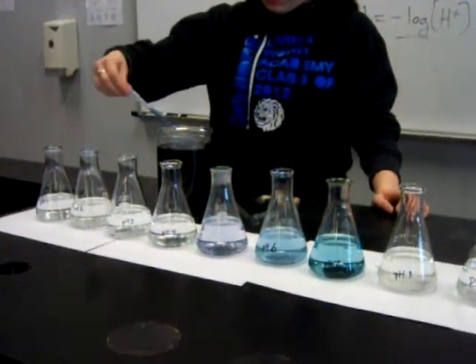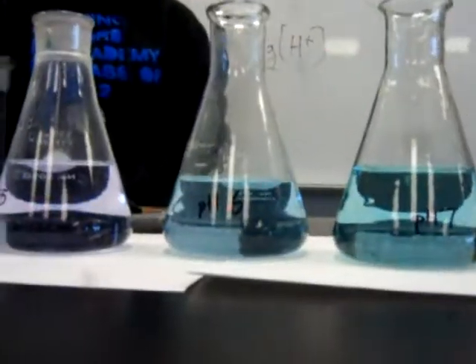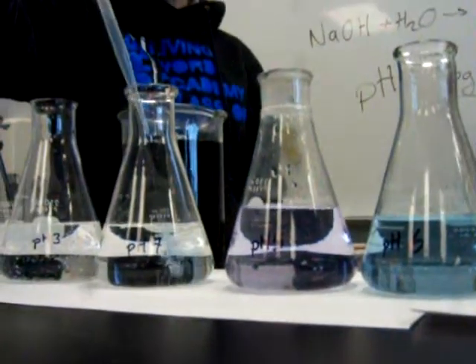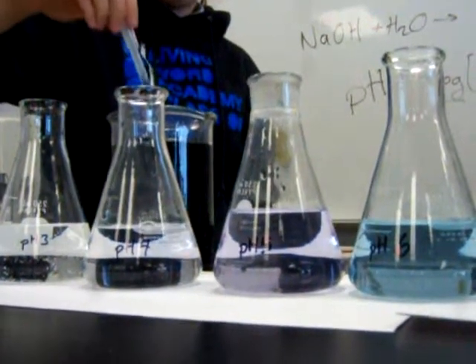Yes, I have it somewhere over here. Litmus, I think, comes from lichens — it's purple. That's cool, and it changes color based on whether something is acidic or basic. We already have different changes just based on this — I'm guessing it's going to be more purple, like a dark blue. Yeah, it's purple.